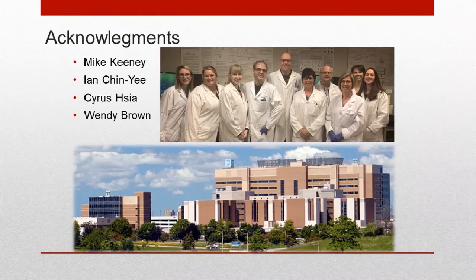So we run 6, 7, 8, 5, numerous numbers on 10-color settings files. So you'd have to evaluate how your LDTs would work on those instrument settings. But it's definitely worth exploring, because it does mean that you don't have to set up your instrument for each individual panel, like your LDT, as well as this ClearLab 10-color panel. Hopefully that answers your question completely.